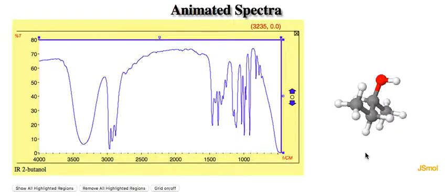If you were to do this in the gas phase, where the molecules were isolated, you would see a regular strong peak, but not this big broad peak. It's because it's hydrogen bonded that you get the strong broad peak. But if you see something like this in your infrared spectrum, you say, oh, my molecule's got an OH in there somewhere. And that can be really, really helpful, particularly in conjunction with the NMR to try to get the groups down. So that's the end of this video, and I hope that's working for you. Take a peek and try some problems.